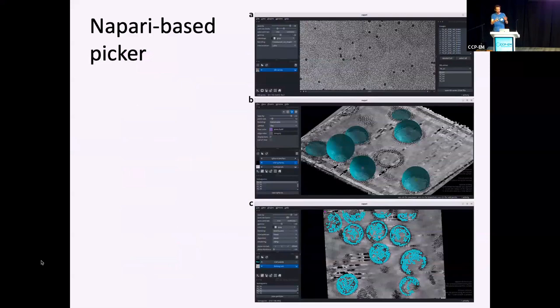We're working on this. It works well if you're on the same machine. It does not work so well if you use it remotely, so if you're not on the machine where you're running Napari, and we're looking at alternatives. But that's for now, this is a workable solution.